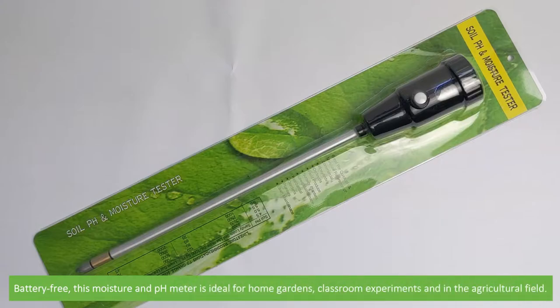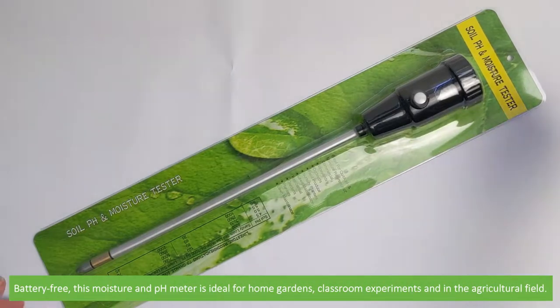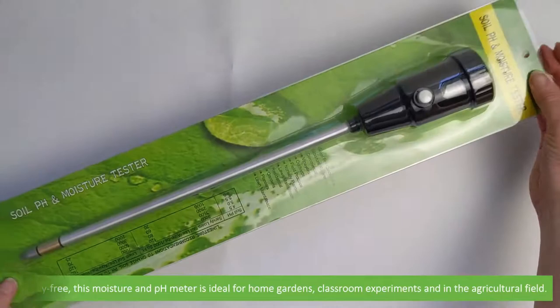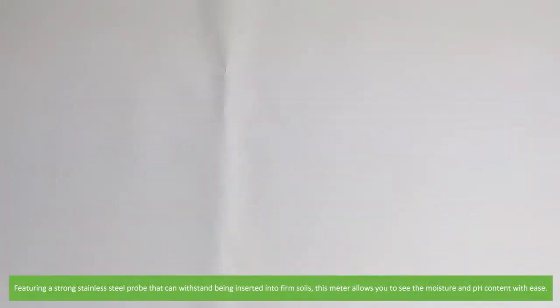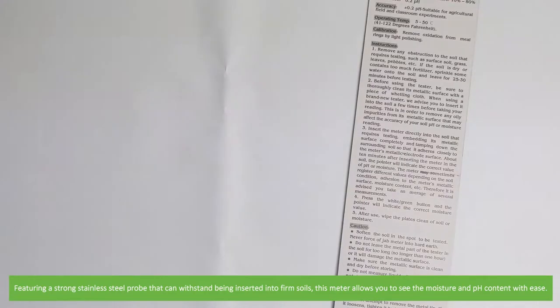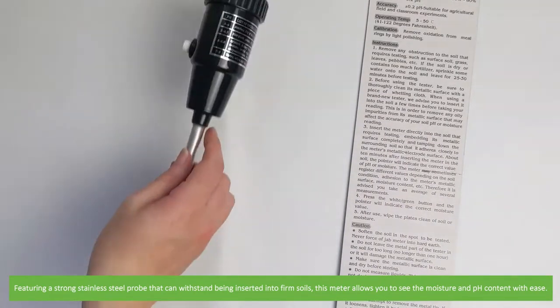Battery free, this moisture and pH meter is ideal for home gardens, classroom experiments and in the agricultural field. Featuring a strong stainless steel probe that can withstand being inserted into firm soils, this meter allows you to see the moisture and pH content of soil with ease.